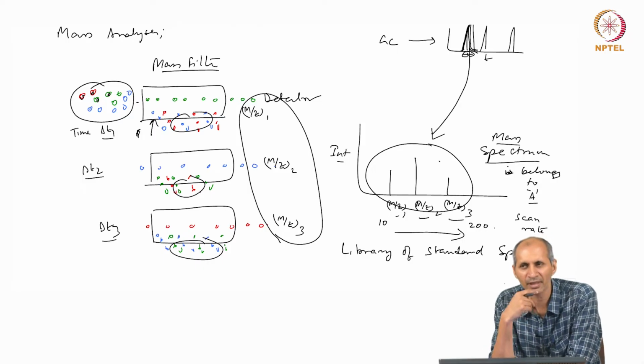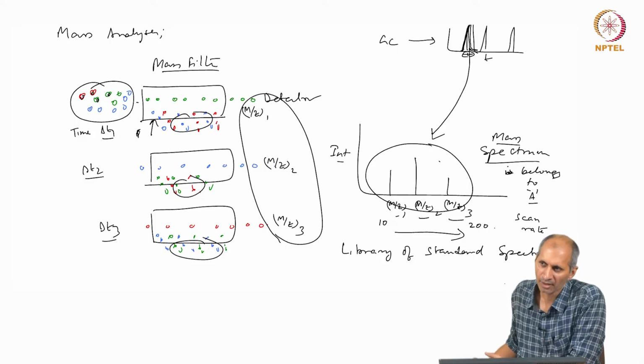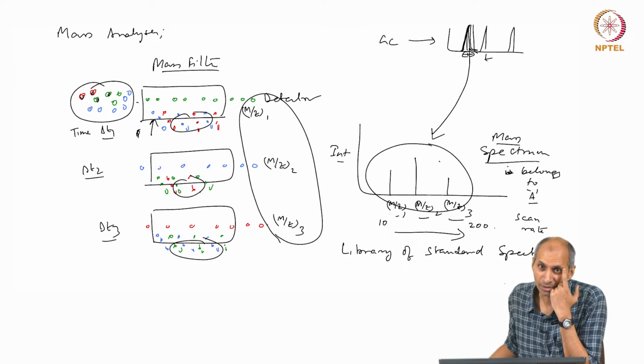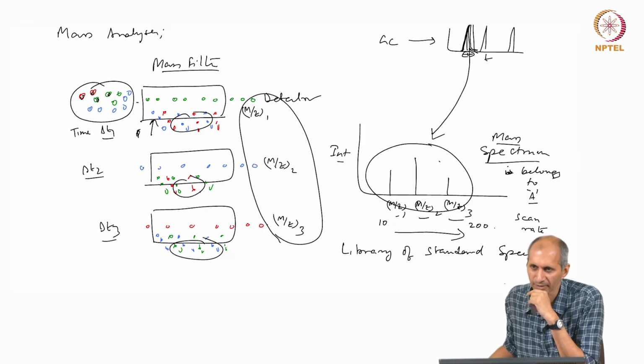Every time somebody manufactures a chemical, they will measure properties, and one of the properties is mass spectra. There are other spectral information that you also get, this infrared, UV visible absorption, a few other things, we will talk about it briefly, fluorescence spectrum and all that. These are information that pertains to the signature of that particular compound.